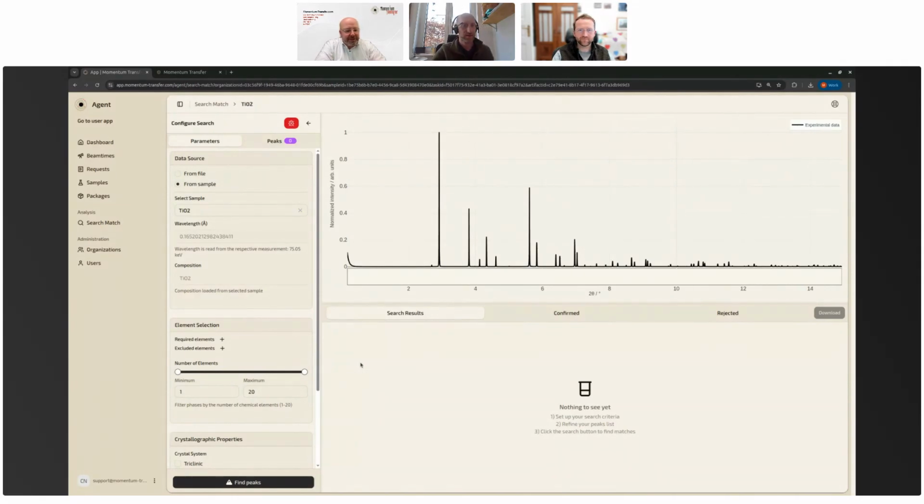And then the last question I think we can answer now is how the score is calculated. So I'm going to be blunt and say we don't really understand the score. I'm not going to lie to you and give you some kind of explanation. What I will say from a practical perspective is you shouldn't really rely on the scoring too much in the current iteration. Oftentimes you'll find the best candidate at a lower score value.